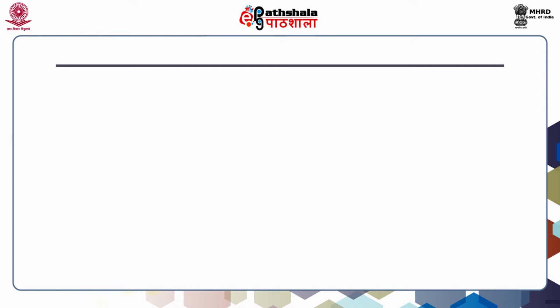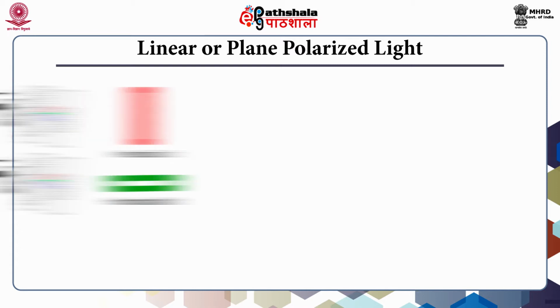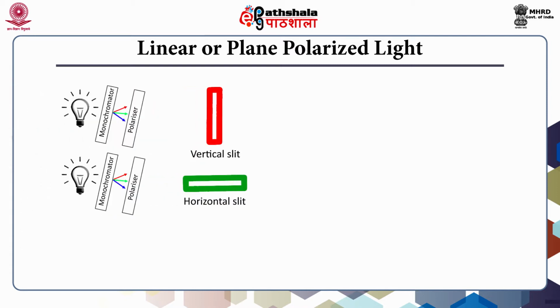First we will take the example of linear or plane polarized light. If you see the source of lights, a halogen lamp, natural light coming from the sun or any star, or any tube incandescent lamp, they are all sources of incoherent light, and the light oscillates in all directions. So therefore they are not polarized lights. So how to produce the polarized light?